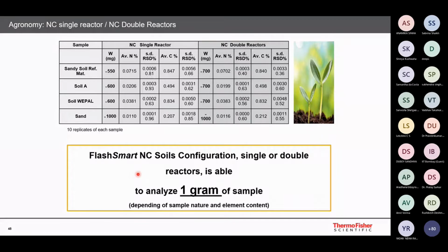So maintenance is required frequently. You can do maintenance on a regular basis. You can clean the reactor, or you can clean the crucible inside that reactor, where ash is accumulated. After 30-40 samples you can clean it and then run again. Otherwise the peak pattern will not come properly. Even the RT can shift, so there is a chance it will happen.